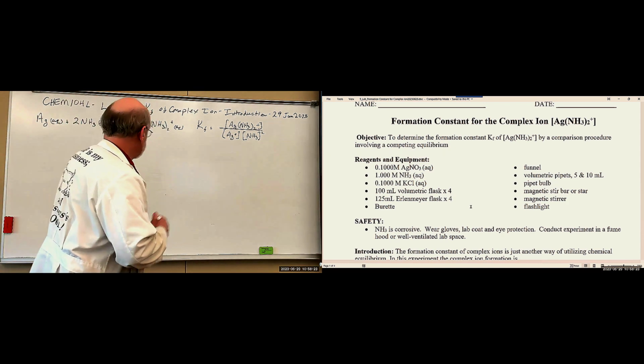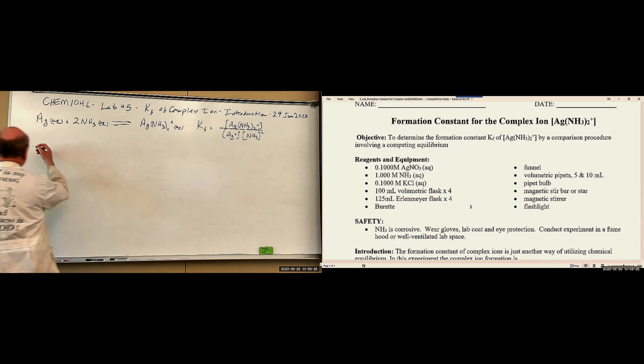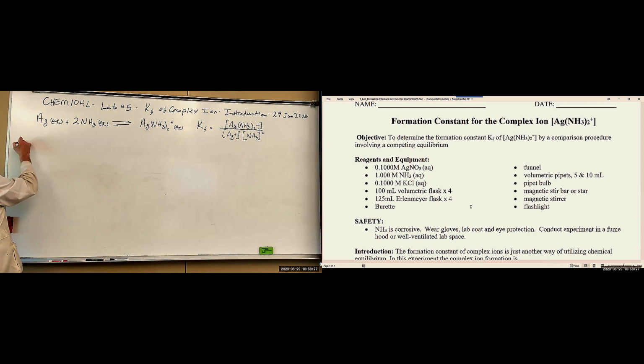Actually, the concentration of ammonia is 1.0419, I believe, molar.